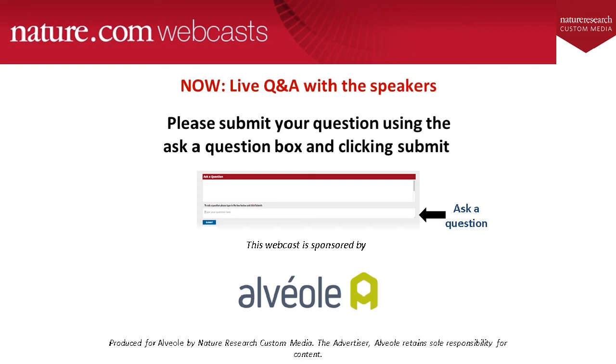Excellent. Thanks, Leeya. Our next question asks, in your presentation slides, it looks as though the pattern appears to restrict the growth of the cell in a certain hollow ring or square. This individual was asking whether the red signal in the figure represents where the ECM is. Perhaps you can try to clarify things.